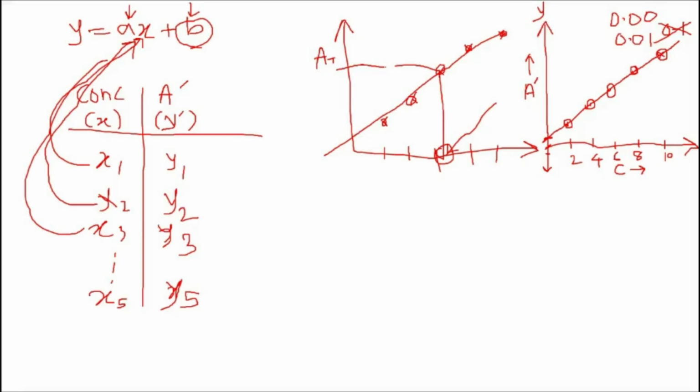अच्छा ठीक है, मैंने अभी ग्राफ बनाया. What should be my next step? Interpolation. Okay, so do interpolation, get the concentration. After I get the concentration, any guesses what should I do next? Excellent, multiply that concentration with dilution factor. After multiplying by dilution factor, what should I do? Okay, ठीक है, conversion of the units. Okay, after that what should I do?